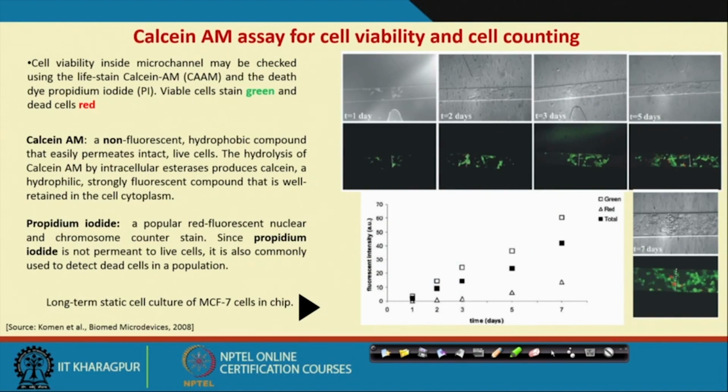Cell based assay system means cell growth. It is a very preliminary experiment in the microfluidic platform. Here we want to measure cellular growth over time, and how many cells are viable and how many cells are dead.